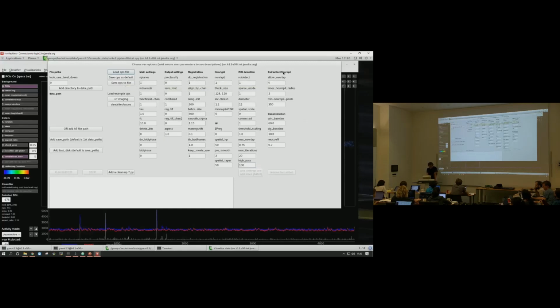Okay, let's see, what else do we have here? There's some options for if you want to allow overlap between pixels or not. By default, it's 0, so this is just that we throw out all of those pixels of ROIs that overlap each other, because we don't want to bother with the problem of demixing them, of telling apart which cell that signal is coming from, which is usually fine if your cells are sparse enough that you only have small overlaps. But if you have a lot of overlaps, you might want to think of other ways to do real demixing.